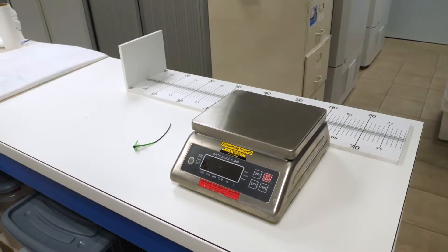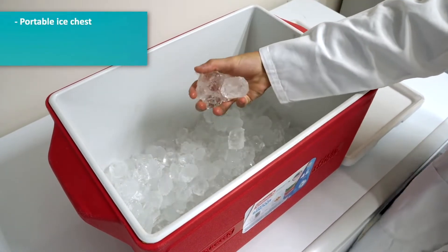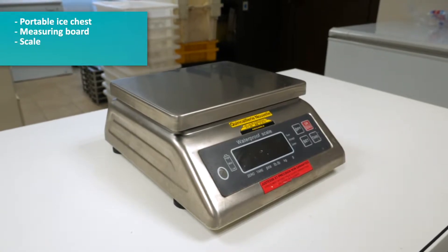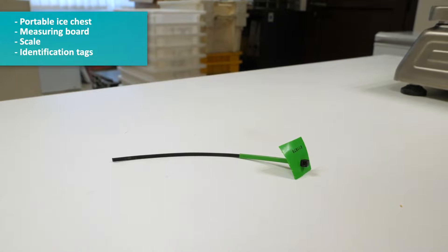To do that, you'll need the following: a portable ice chest filled with ice to hold the fish, a measuring board or a ruler, a relatively precise scale between 1 and 10 gram precision, and identification tags.